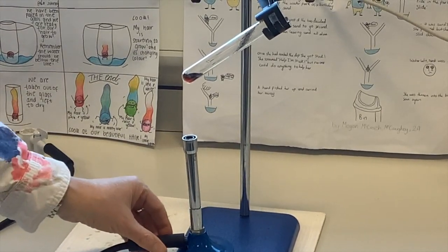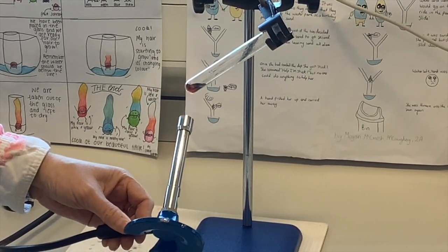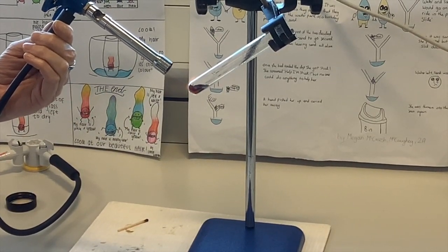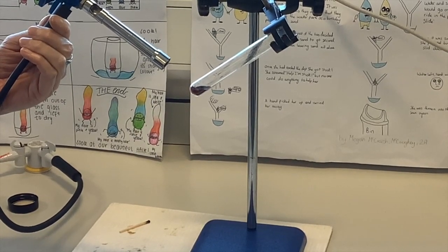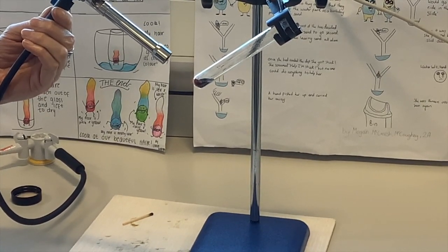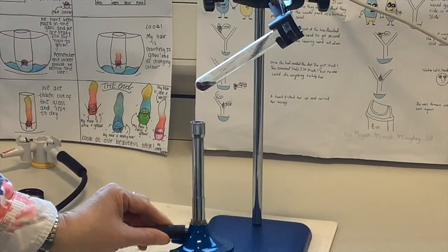I'm going to lift the Bunsen. This isn't something we would always do, but I just want to get it really heating at the side here as well, on the back. Just really heating it from all angles so that it really gets red hot, so that it can have an opportunity to do its reaction. And then at the end, we should see little flecks of copper. I'll just go from beneath again, get it nice and hot.